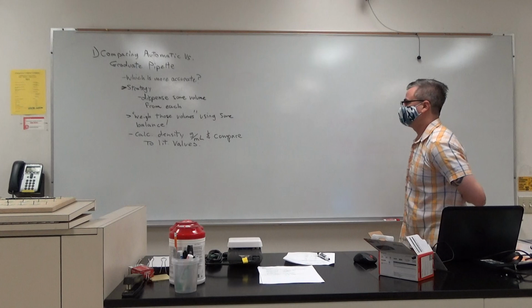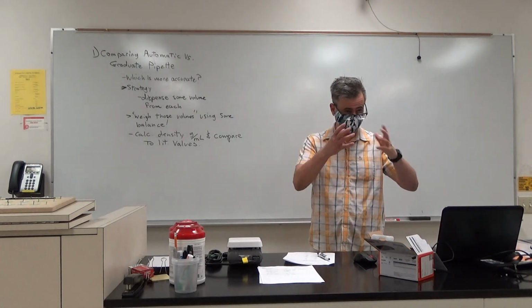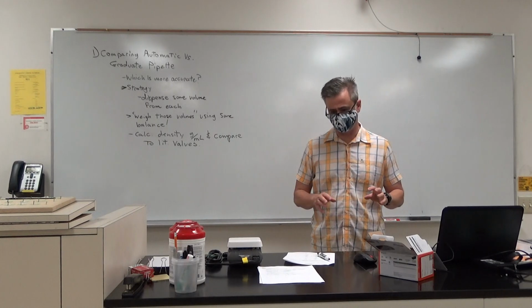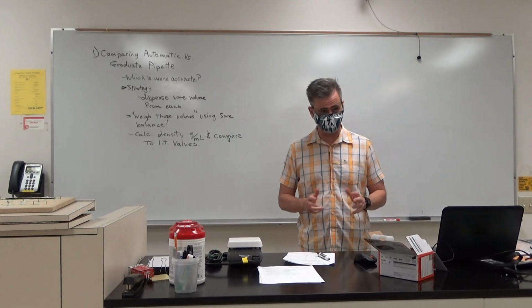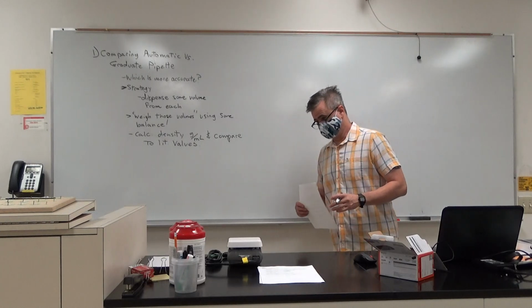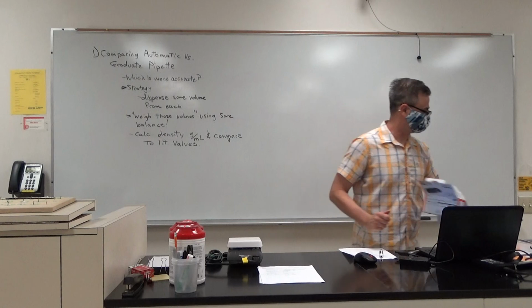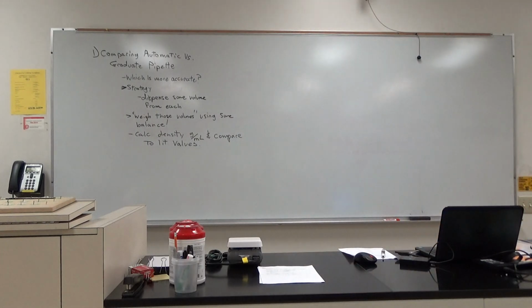Okay. I do it just a little bit differently, or I recommend that you do it a little differently from how it's described in the book, because it'll go a little bit faster. In the book, it just tells you to use one of the conical vials. I should show you what a conical vial looks like.